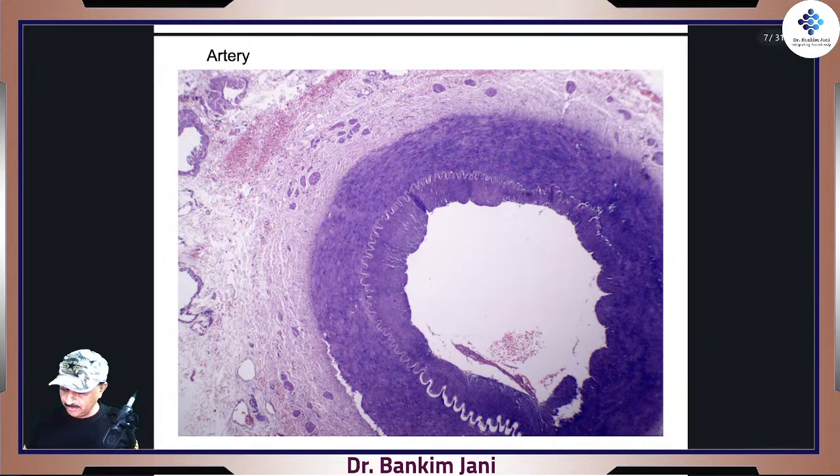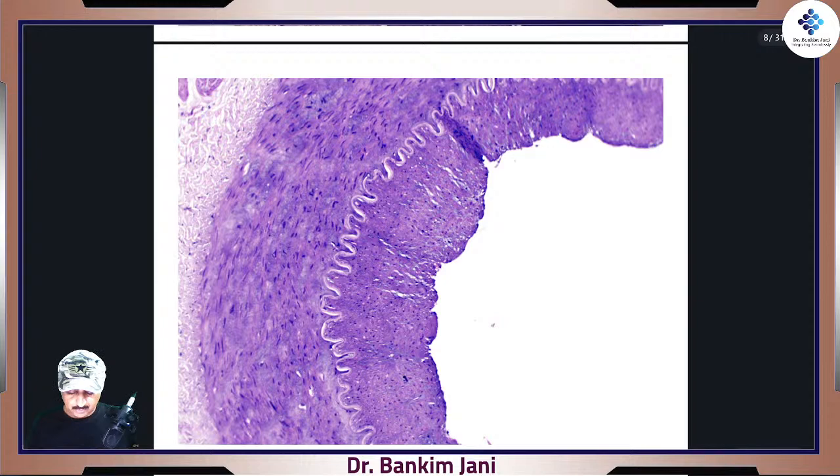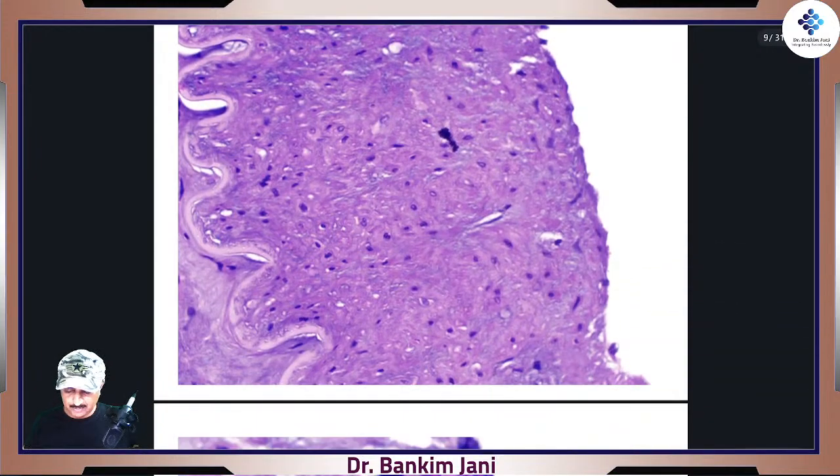So that's why over here you will see this is the bore or the caliber of the artery, the inner caliber, through which the blood would pass. And then these are the multiple layers, and then there are smooth muscles. The same section will be used when we'll be watching the smooth muscles, because we'll see how they are arranged. But right now we just zoom on. We still go further.